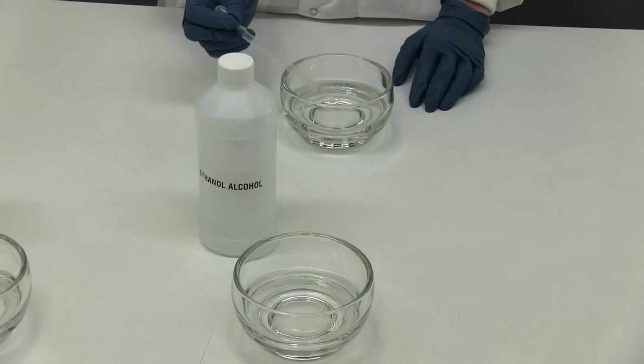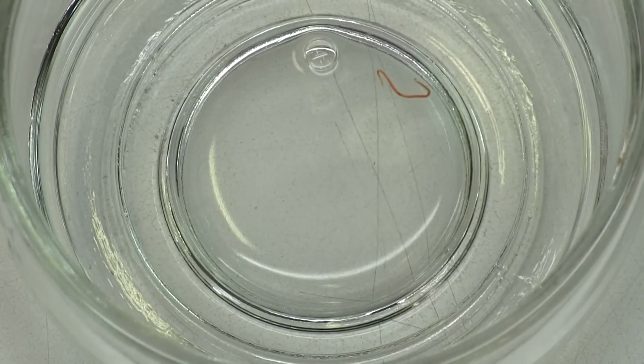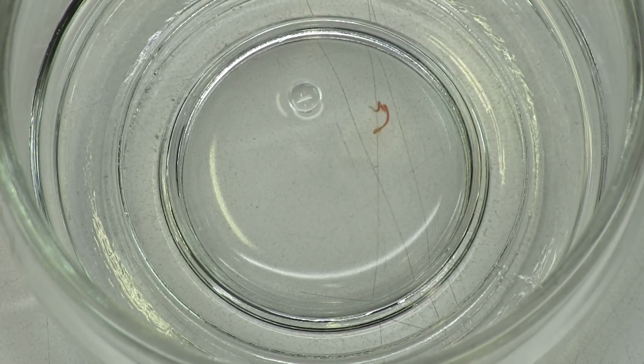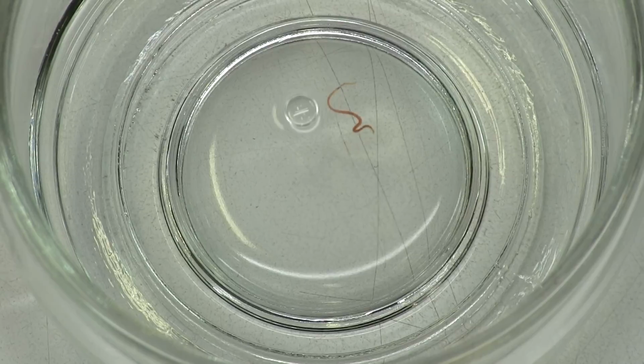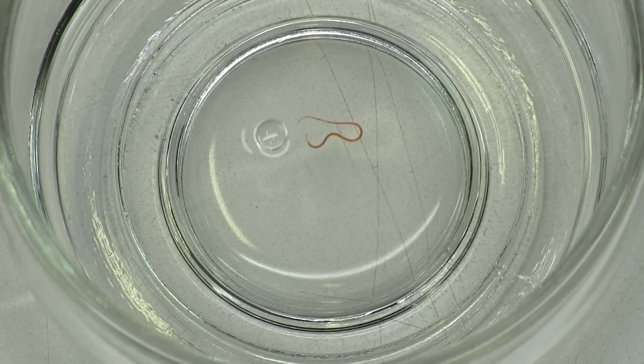The last toxicant we're introducing to the blackworm is ethanol alcohol. Do not use denatured ethanol, methanol, or isopropyl alcohol. With this toxicant, the blackworms might be clumped up, they may appear inactive when probed, and their ends may tend to curl up.